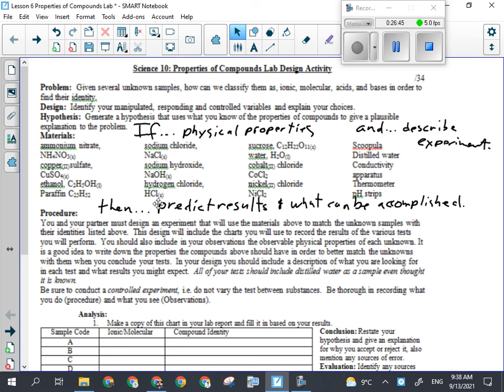And here's the issue. If it spills, it could go into an adjacent depression and contaminate whatever you have in there, and then you'll be doing them both over again. So you want to make sure you don't spill into another sample. So I've got the thermometer in there as I add the water, and then I start to stir with the stirring rod. It's important to have all those details in there for the solubility test.